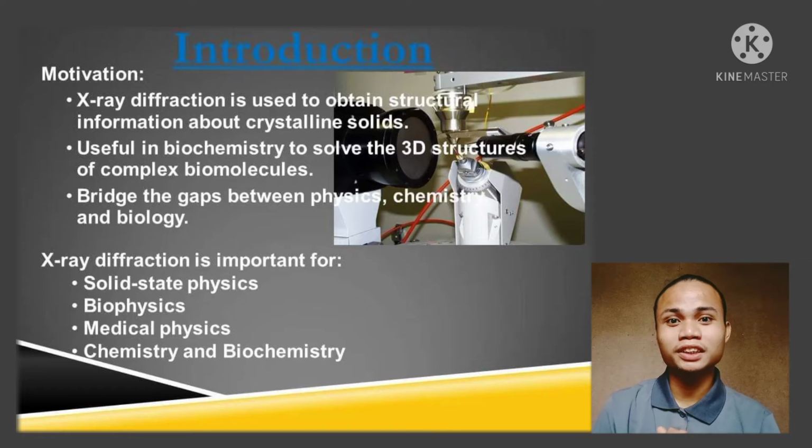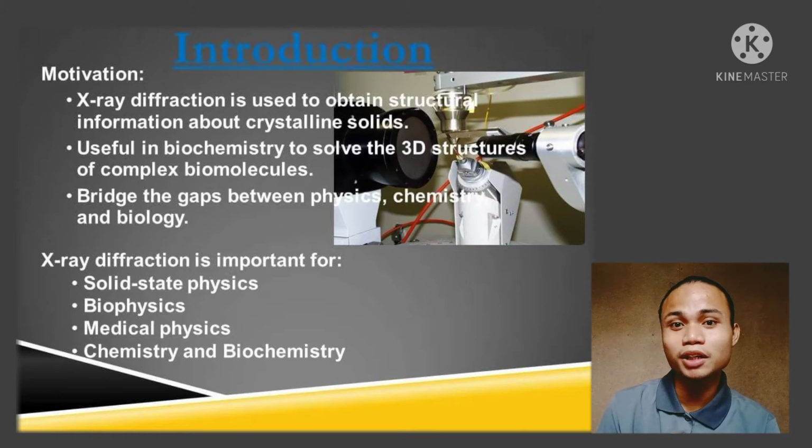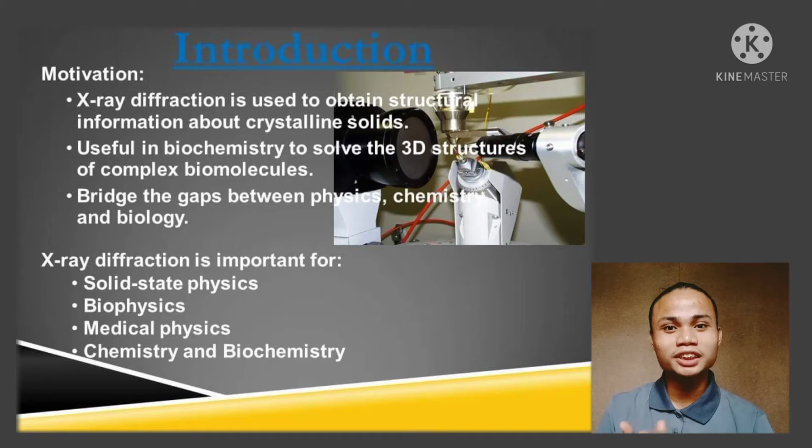What is the use of X-ray diffraction? Well, X-ray diffraction is used to obtain structural information about crystalline solids. It is also useful in biochemistry to solve 3D structures of different complex biomolecules. It also bridges the gaps between physics, chemistry, and biology.